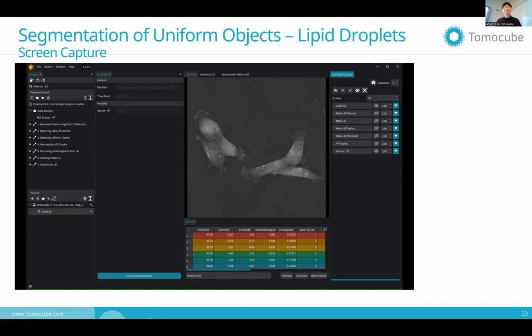There are a bunch of automatic parameter adjustment methods, and we want to have a better understanding of which one is optimal for the pipelines. So we will provide an automatic thresholding method as well, but it's not in the software at the moment. We will release it soon, and we will let you know when we have those features.